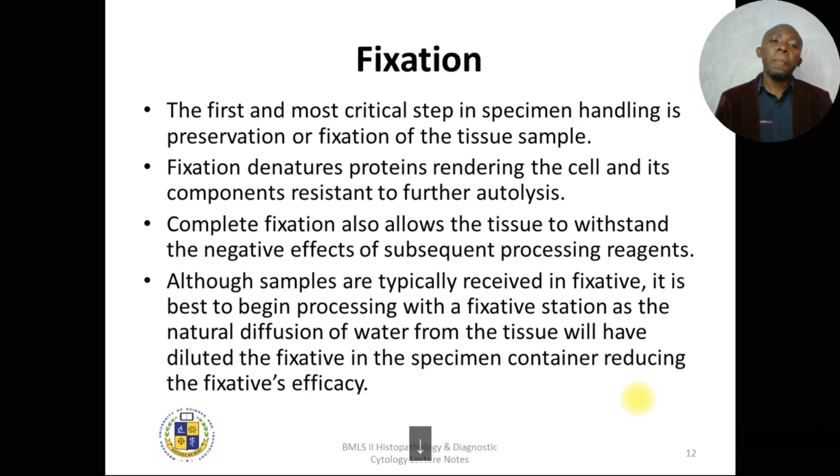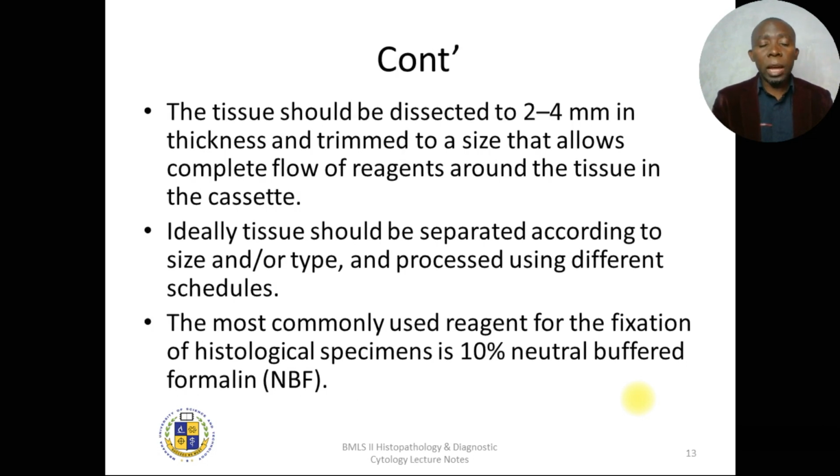So we need to keep the tissue in a state almost similar to how it was in a normal living state, so that we don't miss out the features you see when you watch that video.